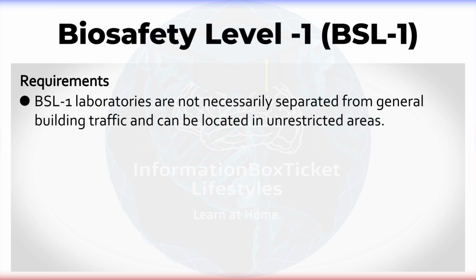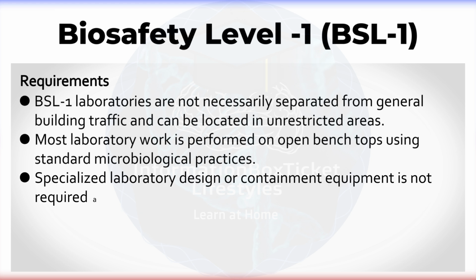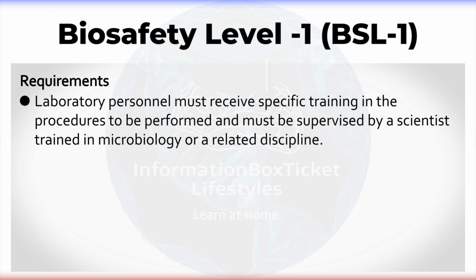Requirements: BSL-1 laboratories are not necessarily separated from general building traffic and can be located in unrestricted areas. Most laboratory work is performed on open bench tops using standard microbiological practices. Specialized laboratory design or containment equipment is not required at BSL-1, though they may be used based on the outcomes of a risk assessment. Laboratory personnel must receive specific training in the procedures to be performed and must be supervised by a scientist trained in microbiology or a related discipline.